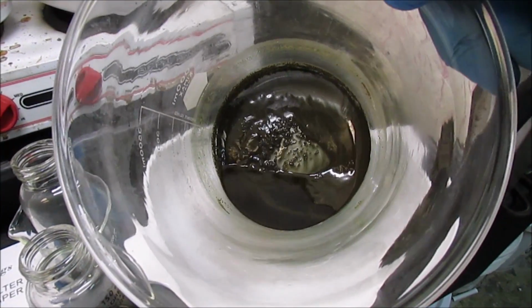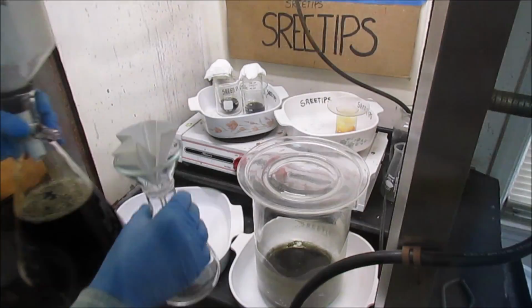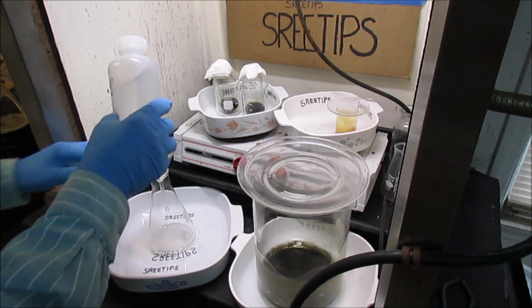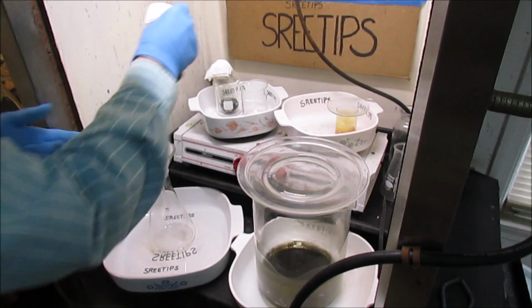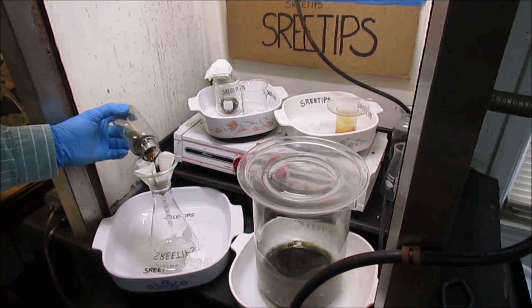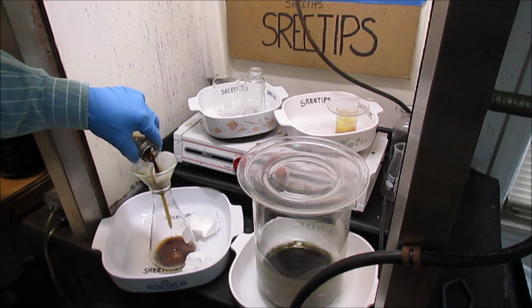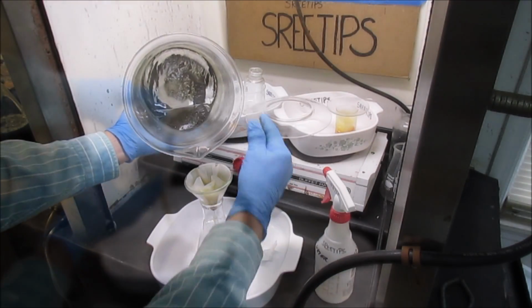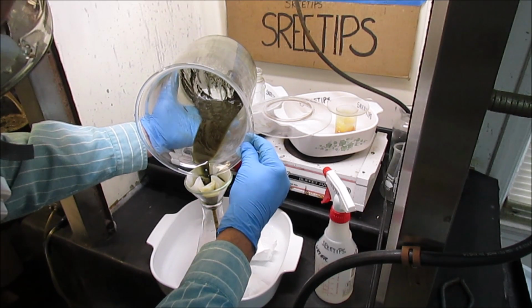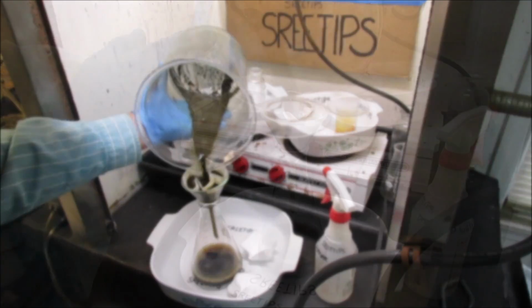Here's a look at the mud. It looks like there's a whole bunch down there, but as you'll see later in the video, it turns out to not be all that much. With the remnants in each of these containers, I just make up a filter here and then pour these solutions with any settled gold right into the filter. Turns out these centrifuge bottles didn't have much gold in them at all. Looks like a lot of gold in there. You'll hear me make some noises. It looks like there's going to be a good ounce or so of pure gold, but it turns out not to be the case.